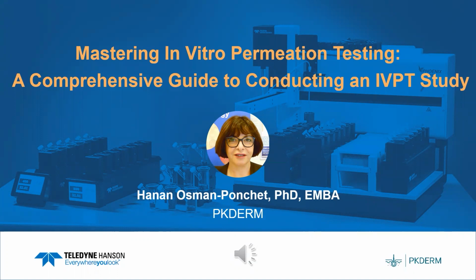So it has taken us longer than expected, but we have worked hard to prepare this very special webinar for you, Mastering in Vitro Permeation Testing, a comprehensive guide to conducting an IVPT study, where we will be addressing most of these questions. Today we'll dive deeper into the topic and cover everything you need to know about conducting an IVPT study, including videos and expert tips, and we hope that you will find it both informative and valuable.